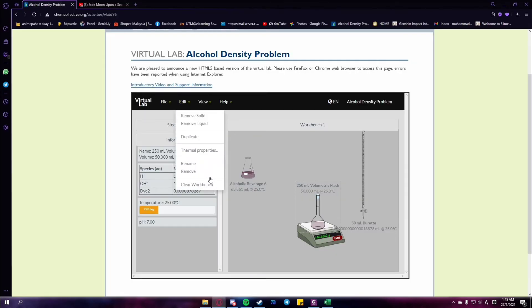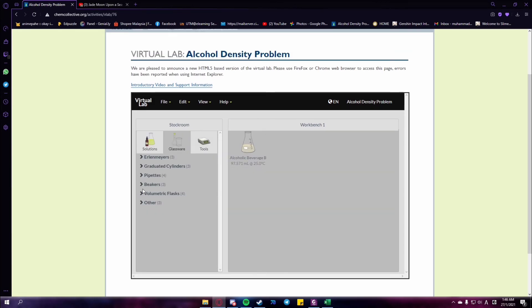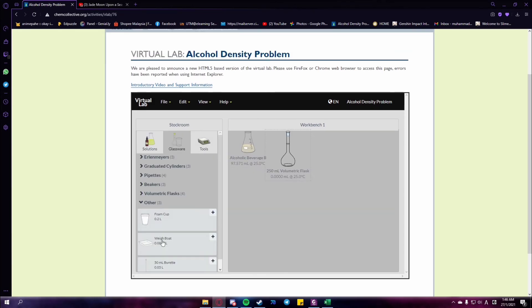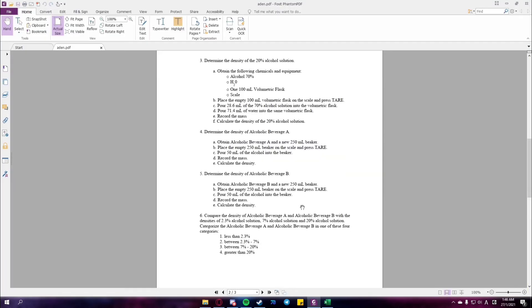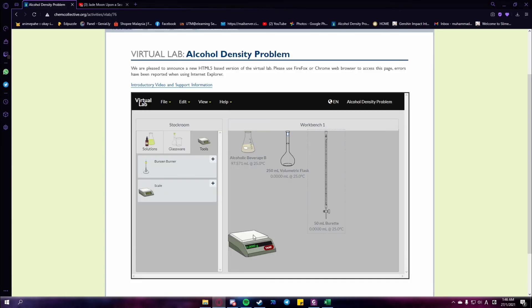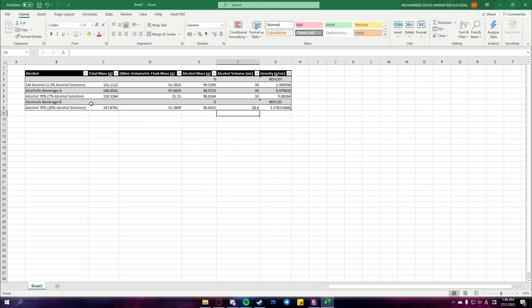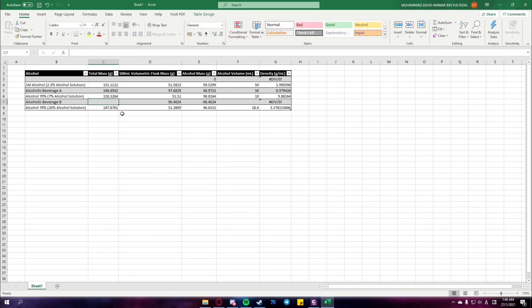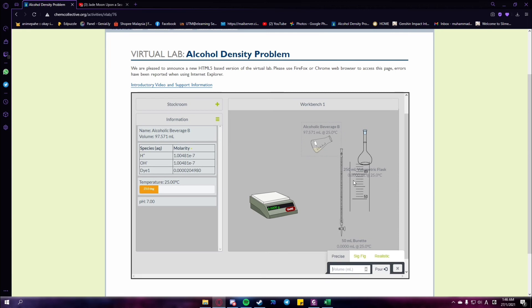Next is procedure 5, which is a repetition of procedure 4 with a different alcohol. In procedure 5, we use alcoholic beverage B. The first step is to record the mass of the empty 250 ml beaker. Then pour 50 ml of alcoholic beverage B into the beaker. After that, record the mass and calculate its density.